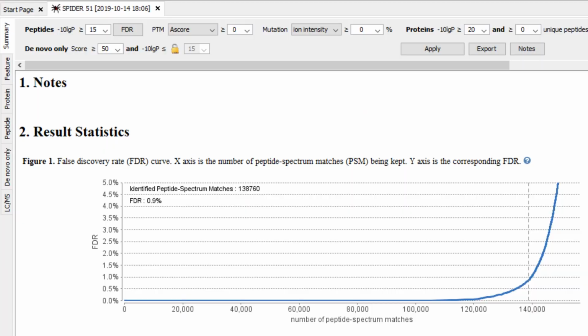In most cases, the FDR is set to less than 1%. The FDR is the false discovery rate. So when the software is assigning a score to a spectrum, they have a threshold which they call the FDR value. Under these thresholds, we can be certain that these peptides are matched to those spectrums. You can see that the curve gently goes forward as the FDR value rises. It means the more proteins you have, the more chances of them being a false positive. Now we took the samples which were less than 1% FDR values.